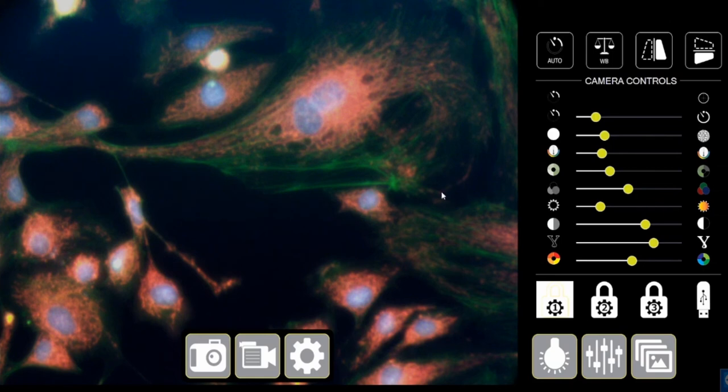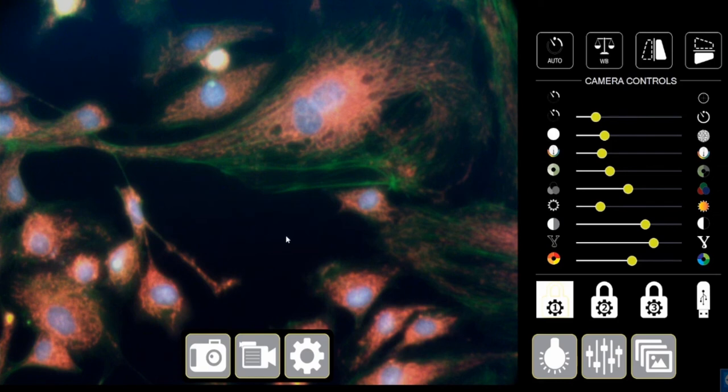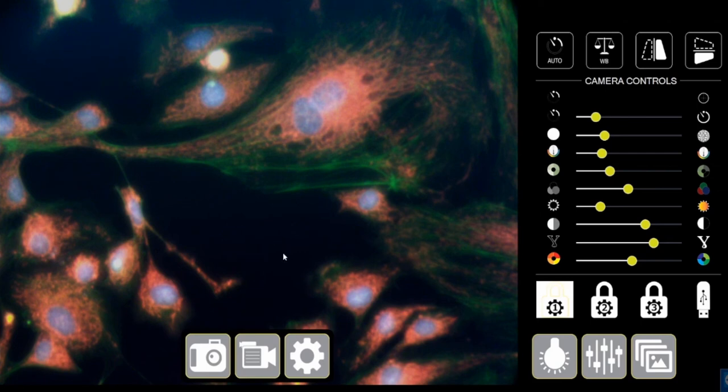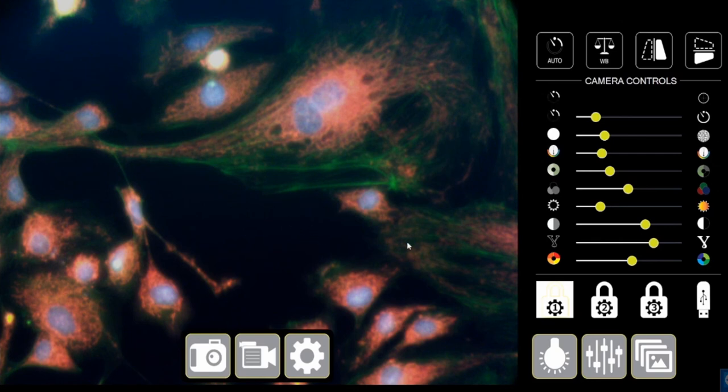You can see how brilliant the image is. You can see the detailing inside the nuclei as well. I did not have to turn on a mercury vapor lamp. I did not have to wait 20 minutes for it to warm up. I did not have to take black and white images in single channels and then pseudo color and layer them. It's just instant on and instant off.